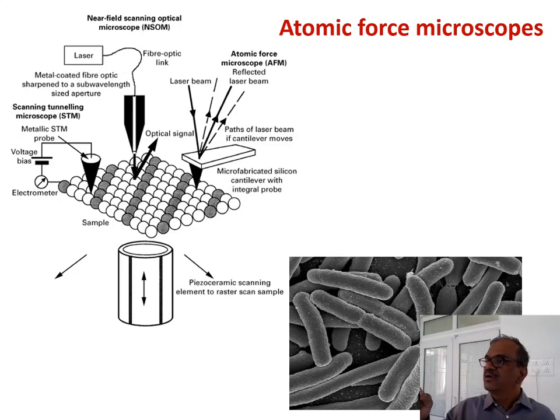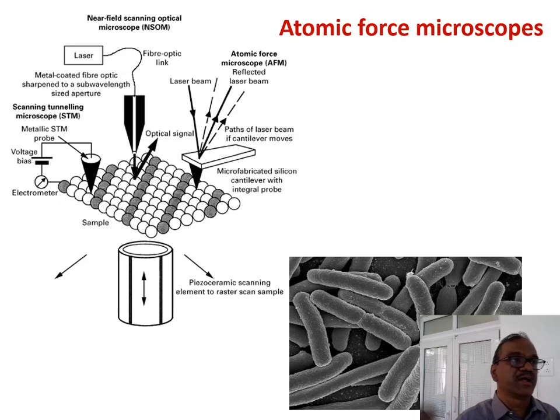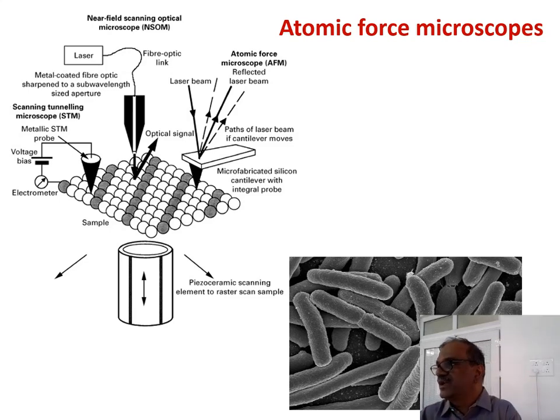Then observe at some 1 lakh times magnification. If you magnify our finger 1 lakh times, the high resolution image looks bigger than an elephant's leg. Am I right? A 1 lakh times higher image. Similarly, you have to see what the relative size is, and also always when you are drawing the diagram, or when you take a photograph, or when you are scanning some specimens, you have to mention how many x magnification. Okay, how much resolution you are able to take.